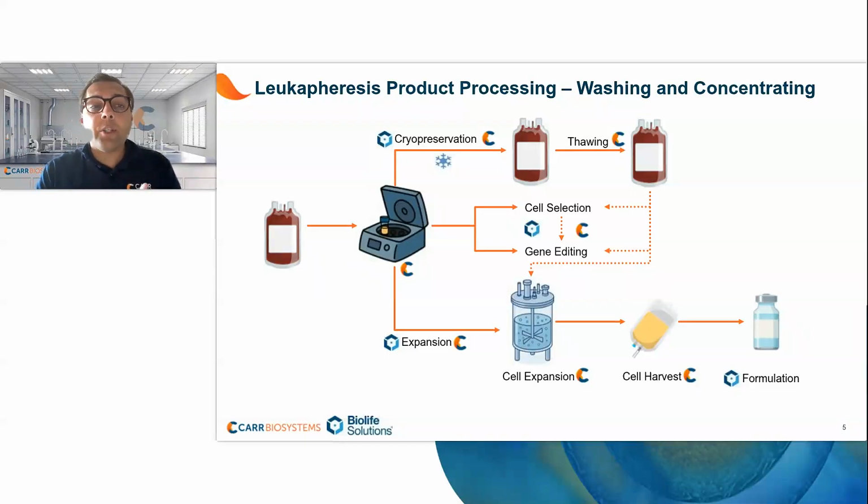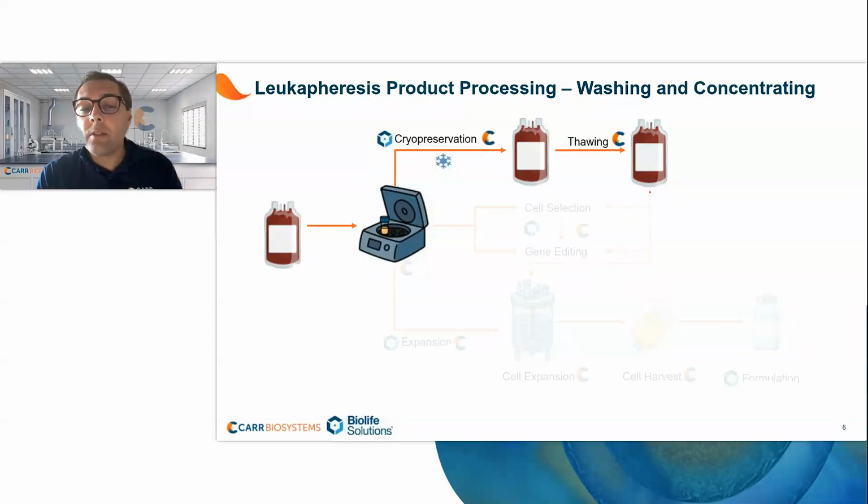So for this collaboration, we've been working through a variety of donors and variety of testing conditions to see whether or not we can take this apheresis product going into final formulation step. But for the next few minutes, I'm going to be discussing the washing and concentrating step of the leukapheresis washing, which leads to cryopreservation and showcasing metrics such as viable cell recovery, viability maintenance, cell population ratios, as well as washing efficiencies.